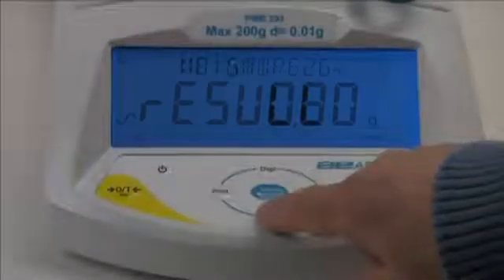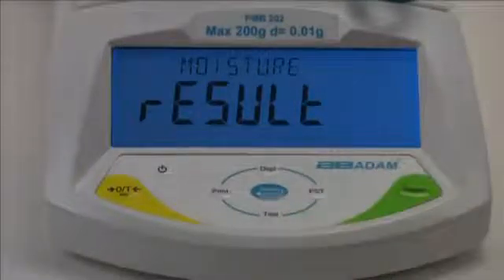Press the test down arrow key to show the result with the current setting: moisture, solid, ATRO moisture, or ATRO solid. Using the display up arrow key and test down arrow key, you can step through the available types of test results.